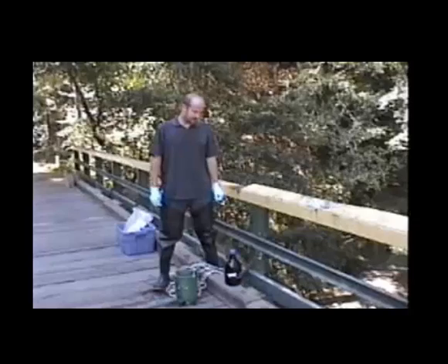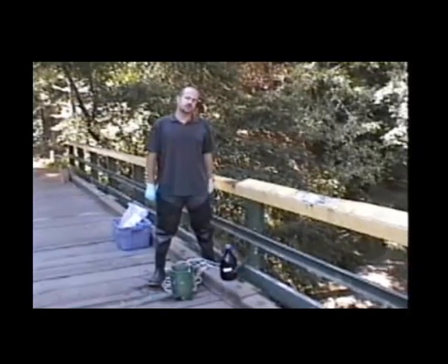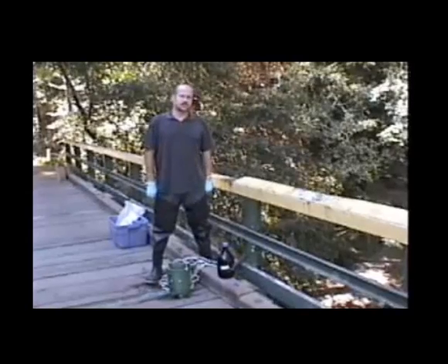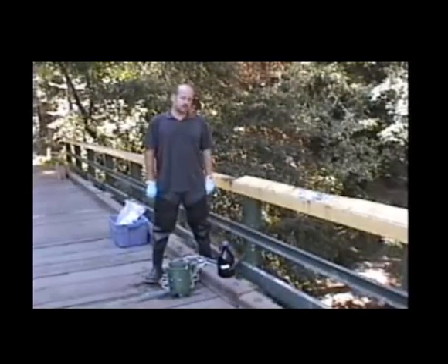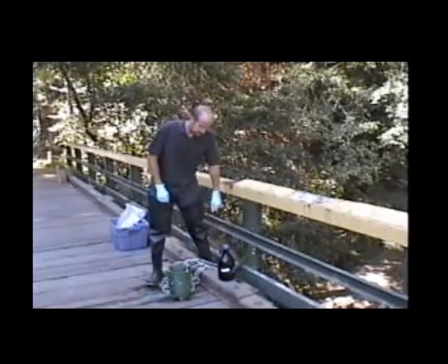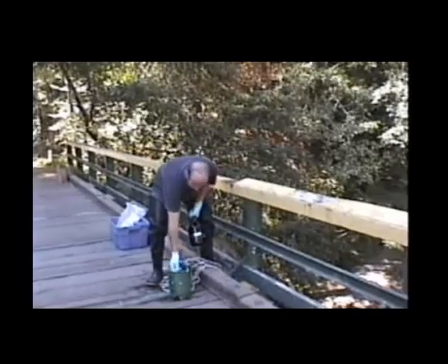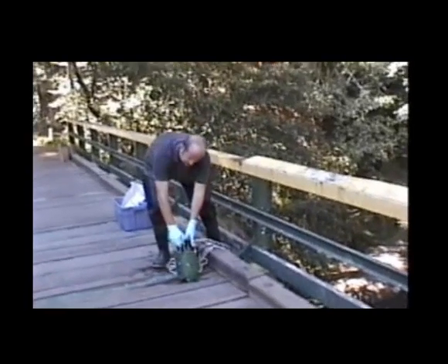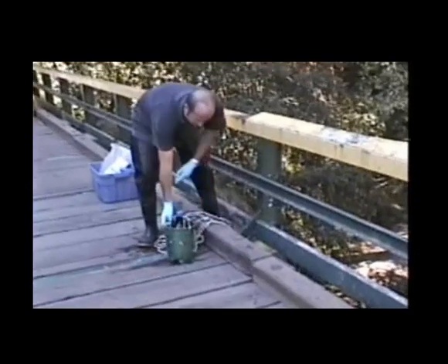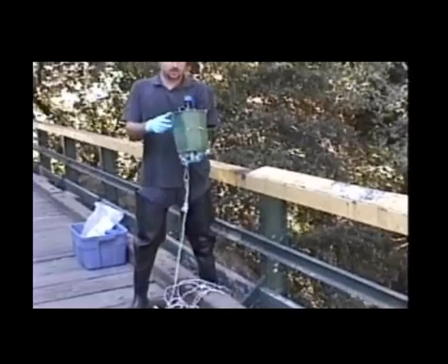This is a demonstration of a bucket sampler. Oftentimes there's limited access to the sampling reach where you want to sample. And there are bridges or hydromodifications where you can actually lower the bucket sampler off of to get a water sample. It consists of your sample bottle and a weighted bucket, where I'll put the bottle in the bucket. The bucket has weights on the bottom to make sure the bottle sinks enough into the water.